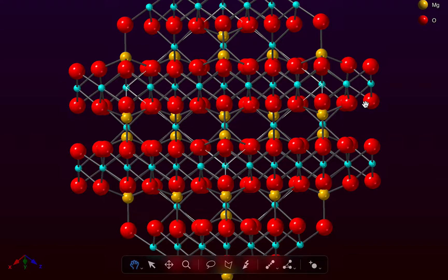I want to emphasize this arrangement but I don't want to have all the clutter of the other atoms. That's where the selection tools come in because we can isolate areas of interest.